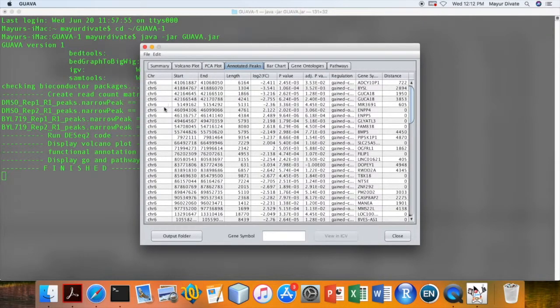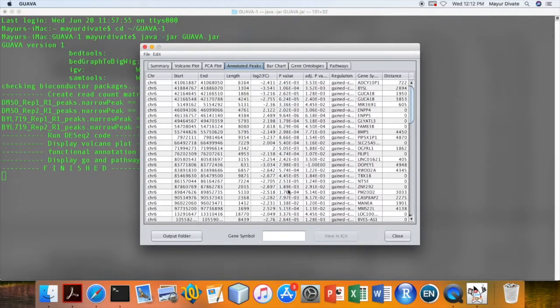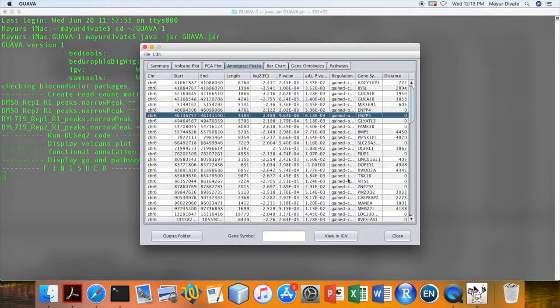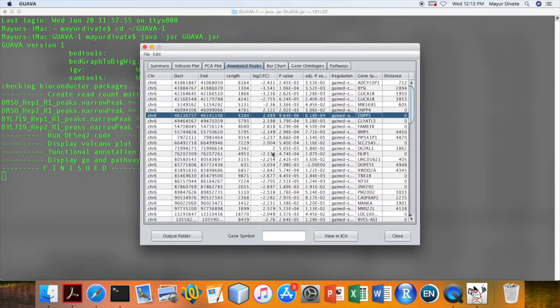Next tab contains the annotated differential peaks. One can search differential peaks using the gene name. To visualize peak in IGV, just select the peak and then click on the view in IGV button.